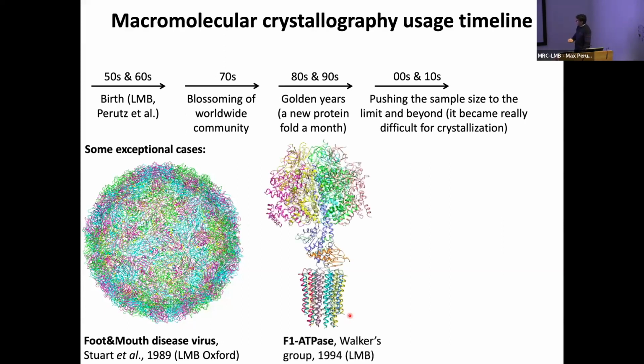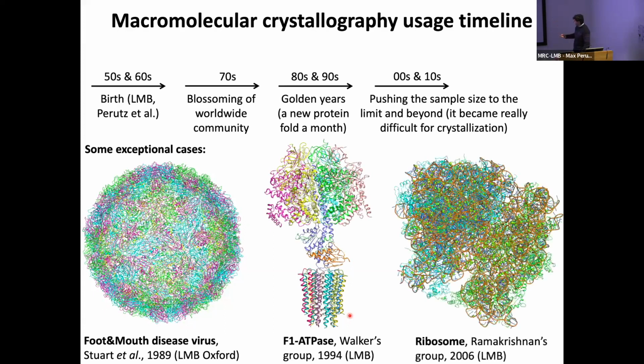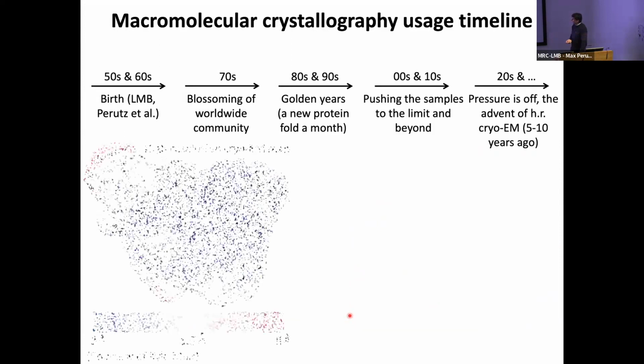Here is a remarkable example from the LMB. This is the most scary of all. This is just a monster. It's possible, but this is almost a lifetime achievement. Thank God there is cryo-EM now. You can take over to do ribosomes, because cryo-EM just crushed ribosome crystallography.